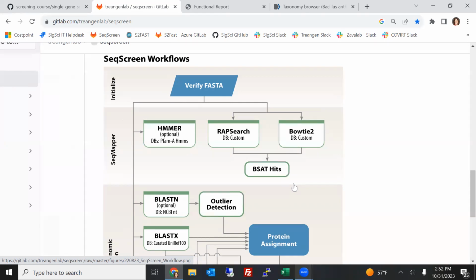Essentially, it means any biological select agents or toxins that were listed in the US lists or the Australian lists, as well as commerce control lists. Basically, any kind of sequence that's publicly available that has been noted by a regulatory authority of being something that we should be paying attention to when we do this type of screening. So taxonomic lists, gene lists that are noted. We put them in this custom database and do some alignments.